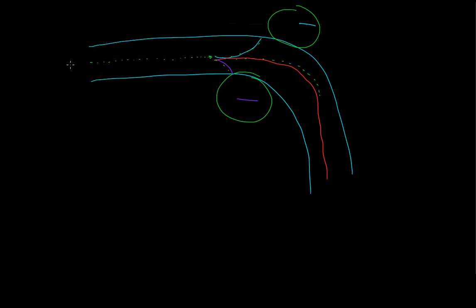So if we have multiple ions in our sample with multiple masses, just like the tennis ball and the ping pong ball, it stands to reason that this finely focused ion beam composed of two different types of ions, so we have our two different ions that were in that solution X, when we change the magnetism on these two magnets, that these two different weight of ions are going to need a different charge to get through the gap.